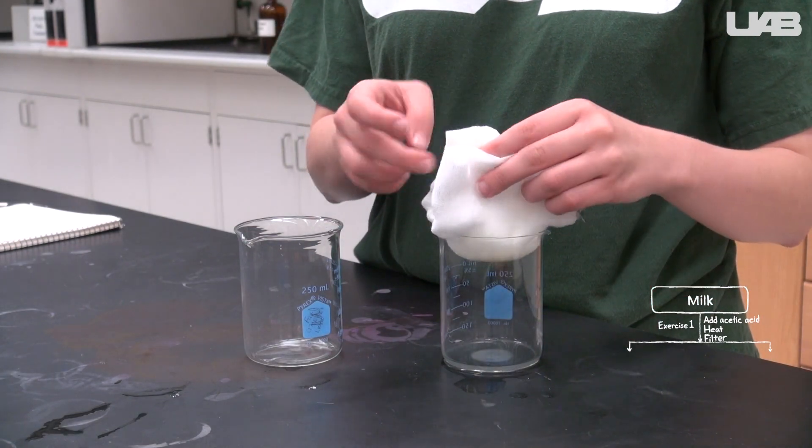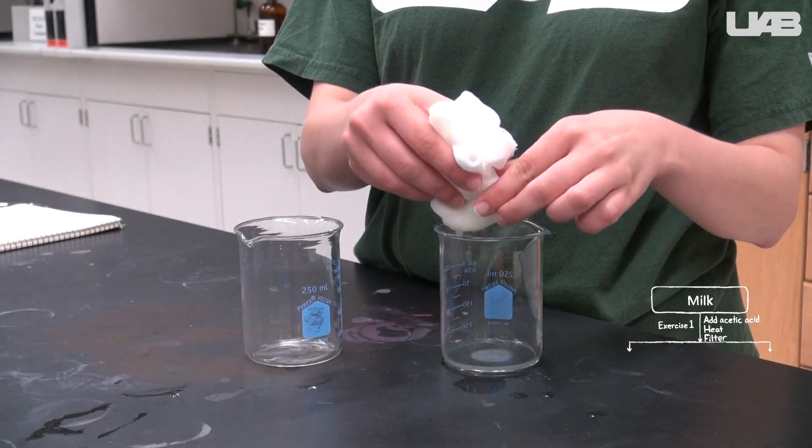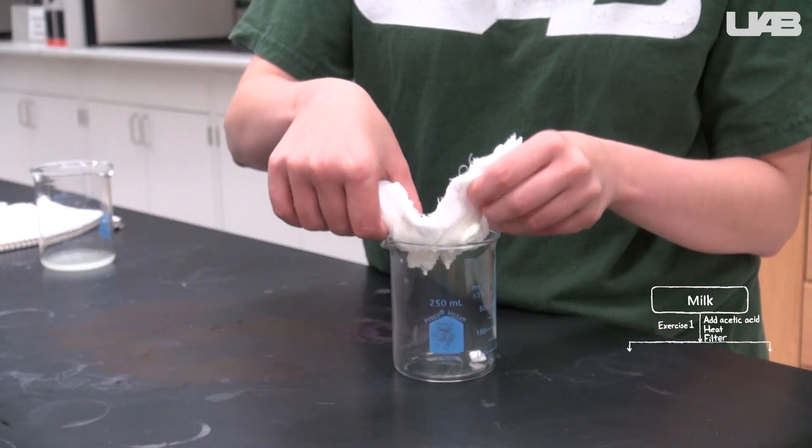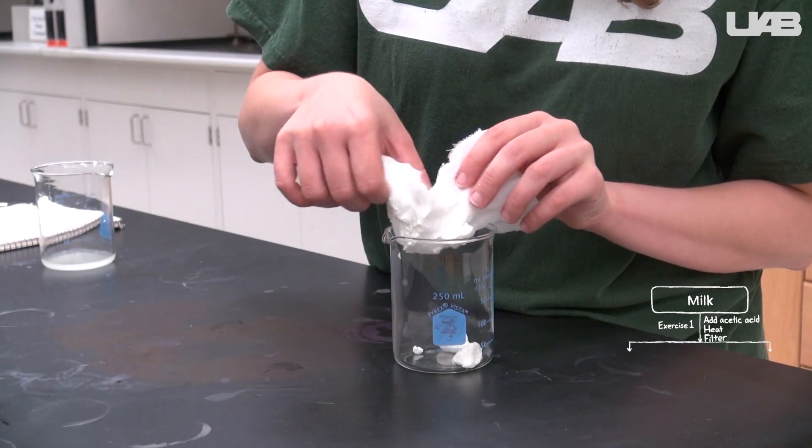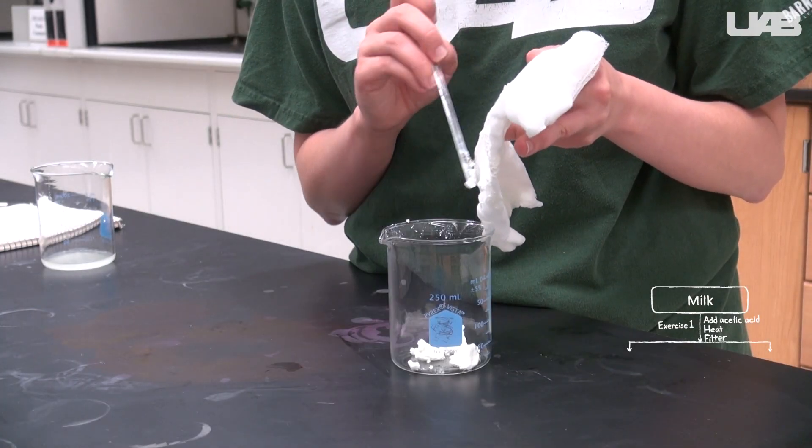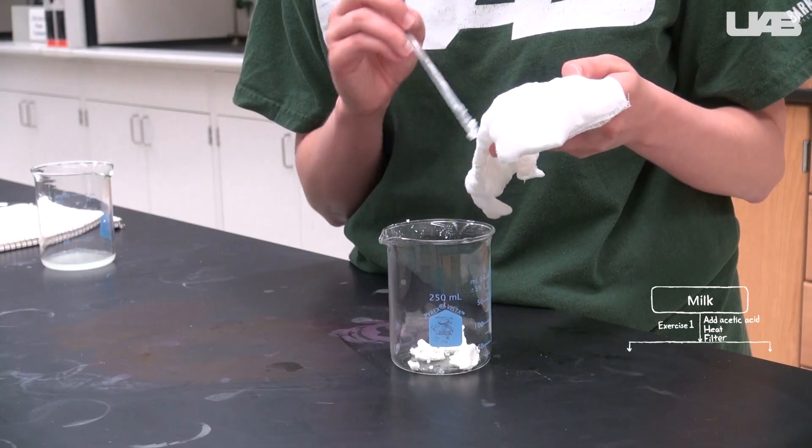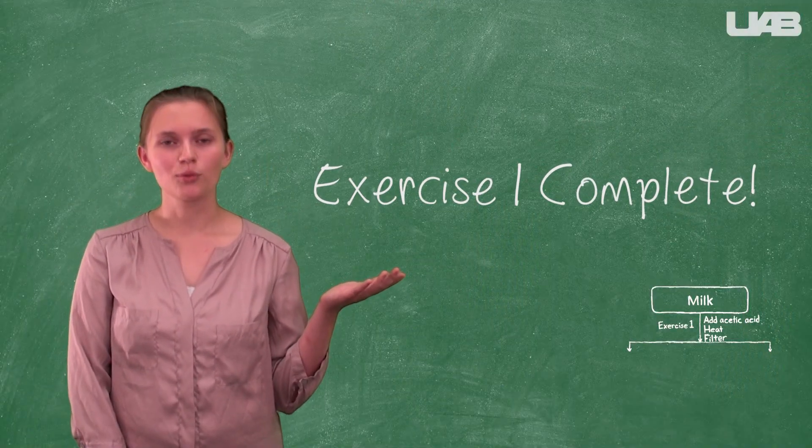Then you can gently press the remaining liquid out of the cheesecloth. Get another beaker and place the protein and fat into it. Aim to get as much off the cheesecloth and into the beaker as you can. At this point, exercise one is complete.